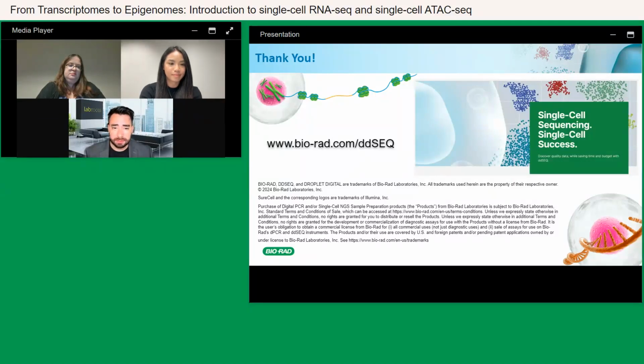Okay, perfect. And one final question here before we wrap up. Have we tried starting with frozen cells? Yes, we do have information on that. We have a resource on the website, a cell preparation guide, that has the protocol for thawing from frozen cells. Internally, we have done it on frozen PBMC, and so we have information and data for compatibility on that sample type.